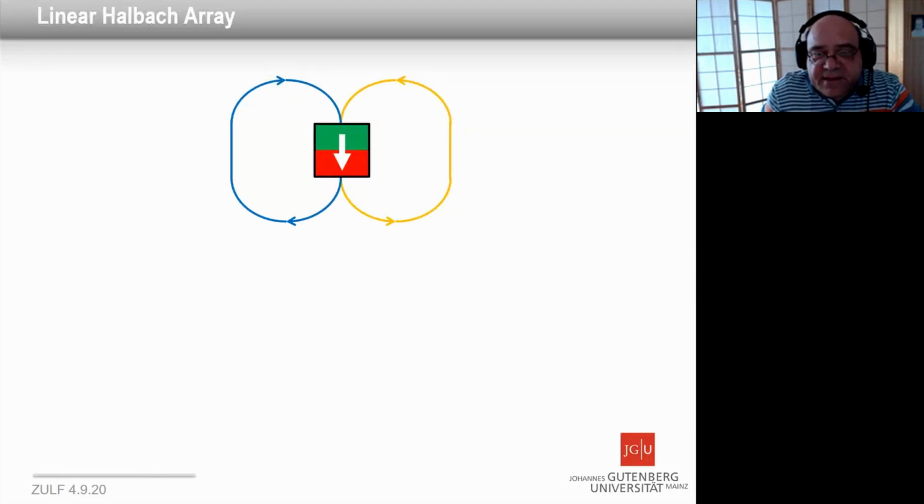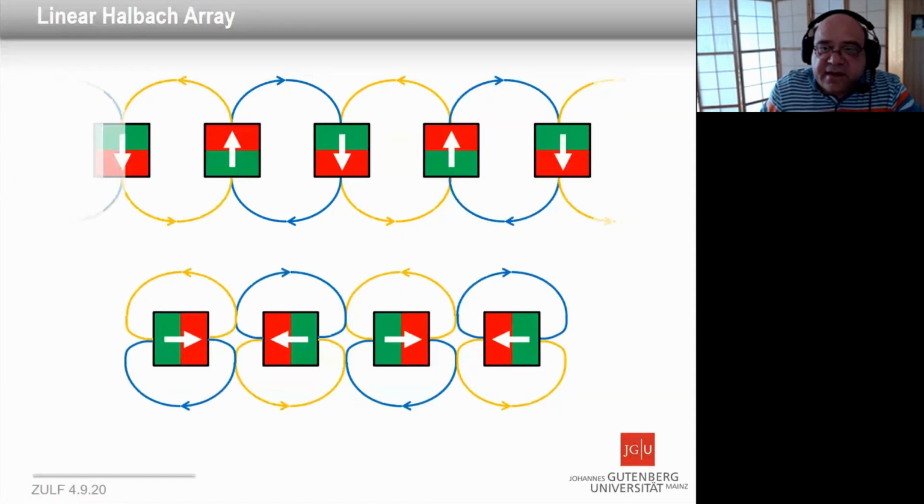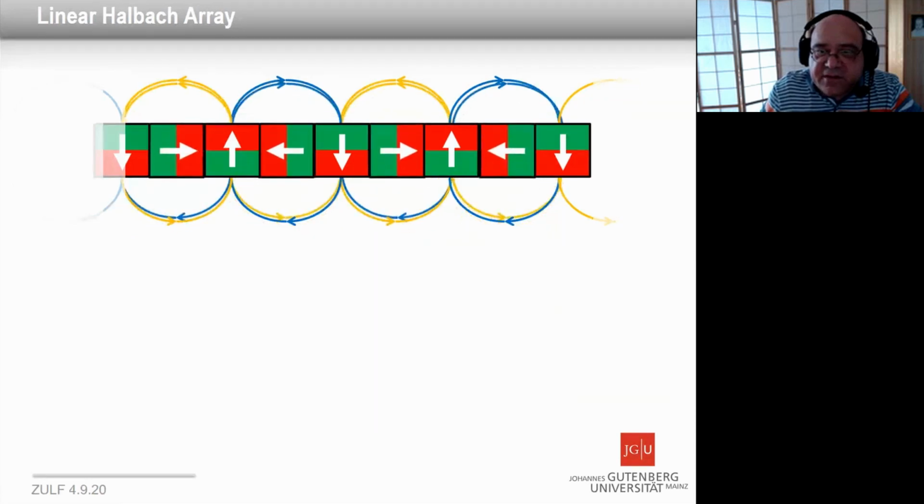So the idea here is that if you take a magnet or many magnets and put them in order here so that they point in different directions, you get flux coming out here in circular direction, clockwise direction and anti-clockwise direction here in yellow. And so you can create a pattern. And now the idea is that you bring in another magnet array, facing each other, opposing each other, so that north is facing north and south. And then you see how these fields add up on one side and cancel on the other.